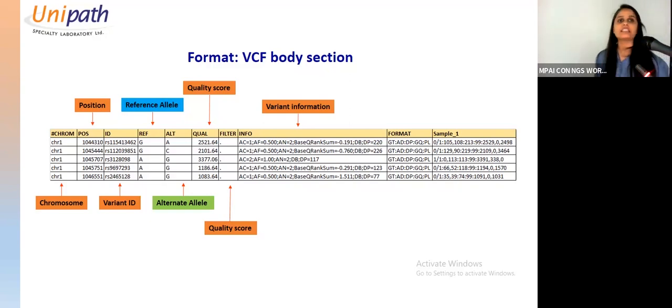So from the VCF itself, you can come to know whether your mutation is heterozygous or homozygous and what the frequency is. Frequency is nothing but the alternate allele count divided by the total, multiplied by 100. If it is germline, you get 40 to 60% most of the time. It is homozygous germline, so that's why it's 100%. So your variant allele frequency is 100%.